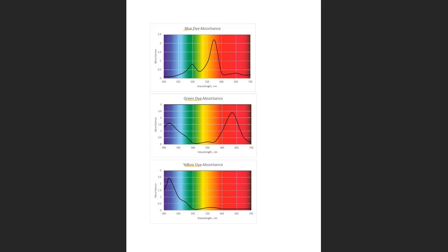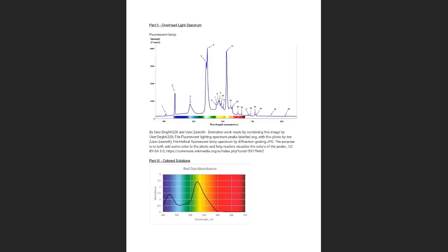So the first thing that they will ask you is, what is the wavelength of the first peak in the spectrum from the red solution? So let's go back to the red solution. That will be this one. We have a red dye, and they are asking, what is the wavelength of the first peak? This is the spectra.